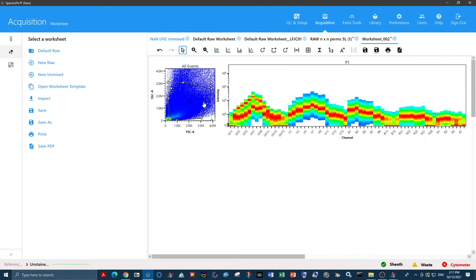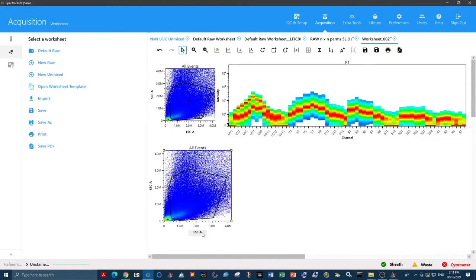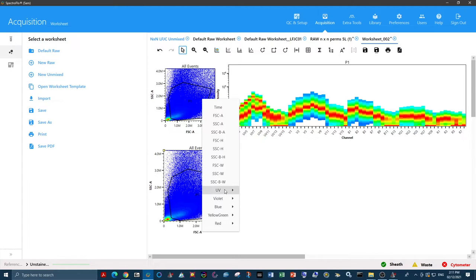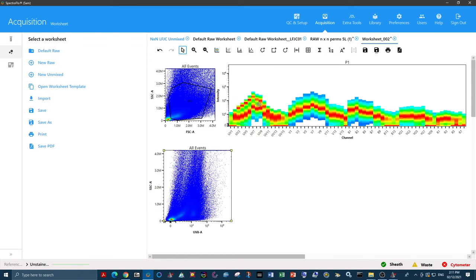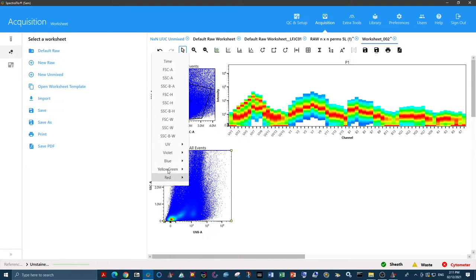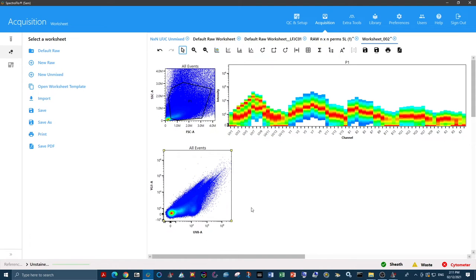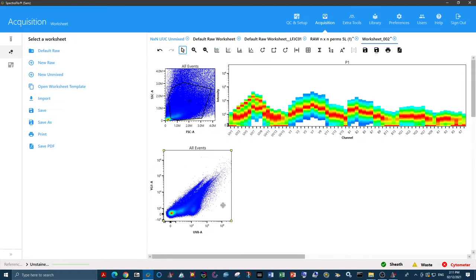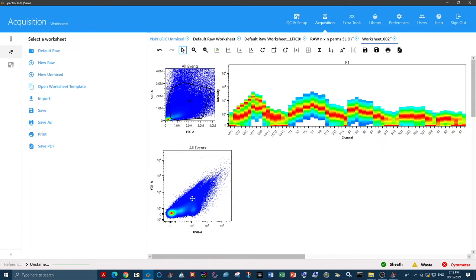So if we create a new plot, and we take our UV channel somewhere in this region of heterogeneity, and we plot that against our YG1, then we can see that we have a few different regions of heterogeneity. We have our very dim autofluorescent section down the bottom left. We have this population over to the right, this population up the top, and this population that runs down the middle.